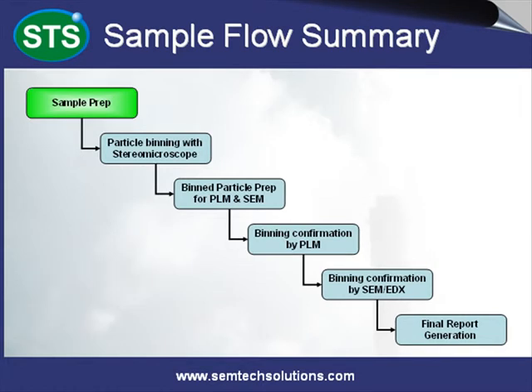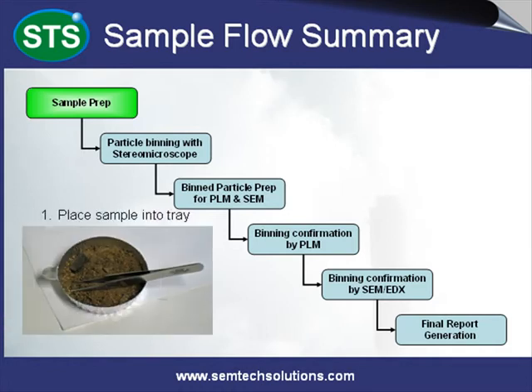To properly prepare a sample for analysis, we typically run through a three-step process. First, we use a spatula to randomly scoop different parts of the sample and deposit them into an aluminum dish. Next, we remove any obvious organic matter from the dish with tweezers — for example, this may include sticks and leaves. Also at this point, if there are larger suspect particles contained in the original sample, we will add these to the dish as well.